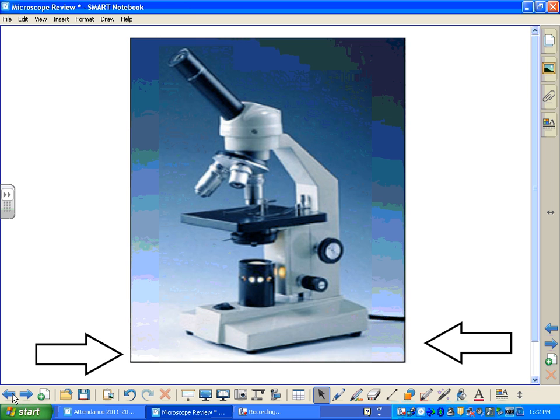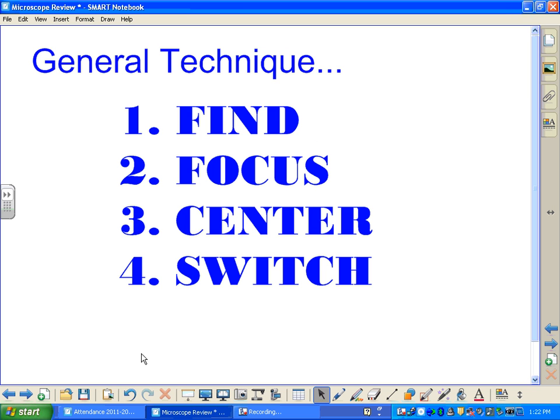Let's go through the basic steps of using your microscope. Once you've set it up, when you're on each power — low, medium, and high — you're going to follow four basic steps. You're going to find your specimen, focus on your specimen using the focus knobs, center at least one of the specimens in your field of view, and finally switch to the higher power. Of course, when you're on high power, you don't necessarily need to center or switch your specimen because you're not going to another power beyond that.